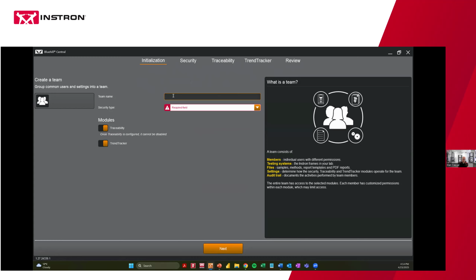So it's going to ask you for a team name. For this first team, I'm going to create a development team. I'll call them my dev team.